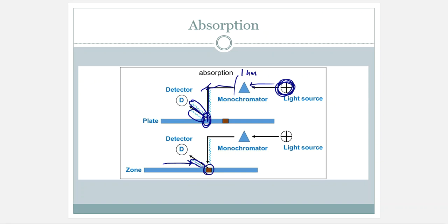All right, guys, in the last video, we were talking about densitometer reads and all of these things about absorbance and what's going on onto the surface of a plate and these little components absorbing UV wavelength, whatever they are, 254, 350, 418, blah, blah, blah. Okay, well, either way, we were talking about absorbance and what goes on in this area or in this world of quantifying TLC images and TLC ideas.